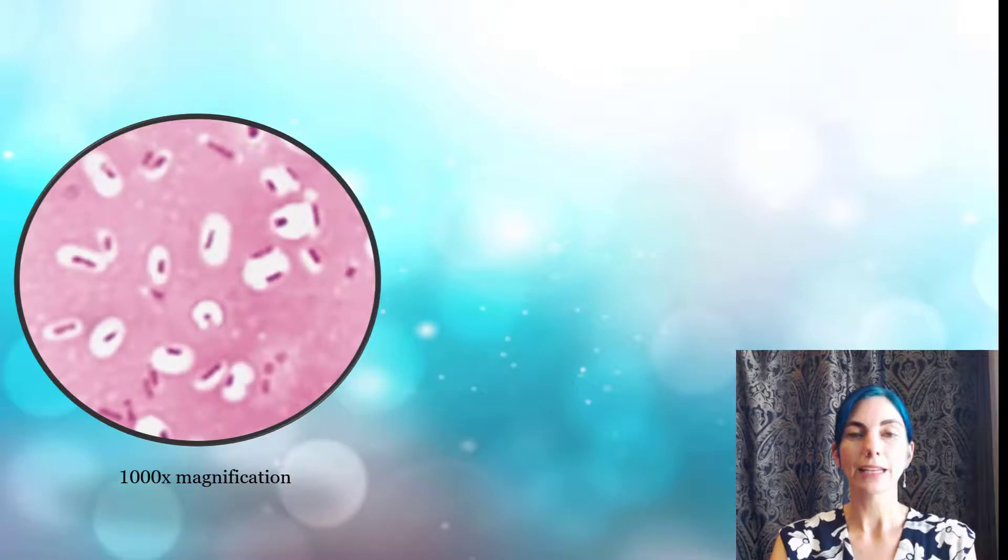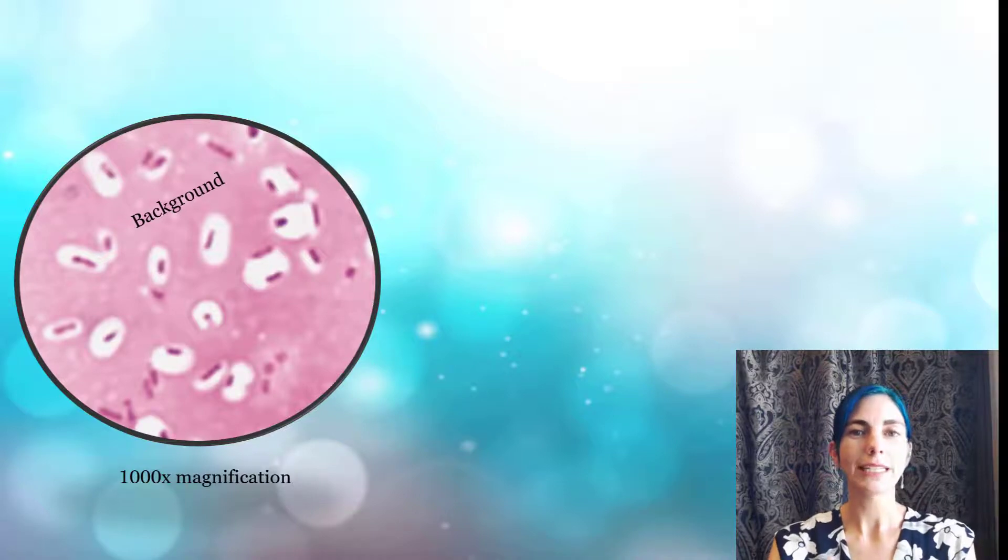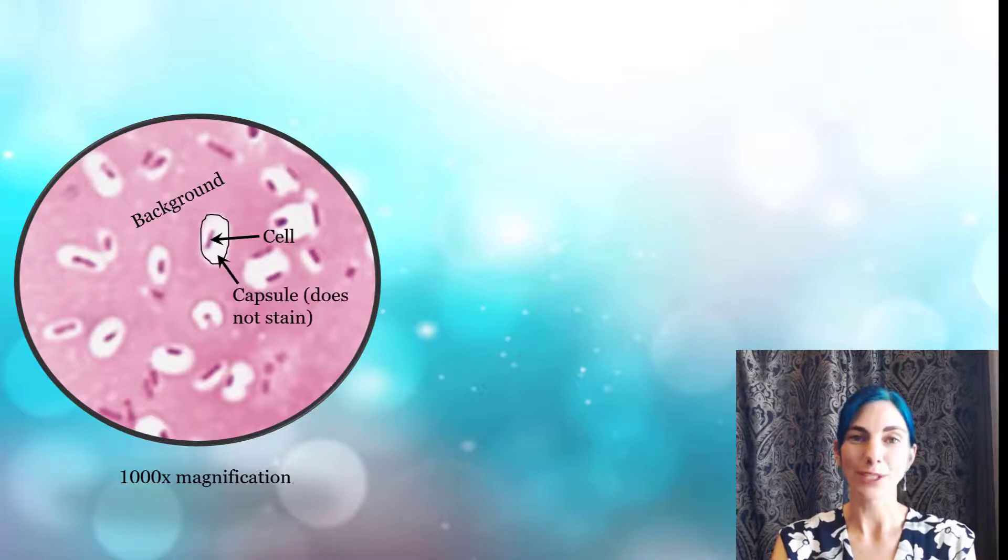Well let's blow up this image just a little bit and see if we can identify some parts. So the first thing to identify is where is the Congo red that stains the background? Well it's here. Notice it's actually not red but more of a light pink color. Now we need to identify the vegetative cells. The vegetative cells are stained with Carbofusion and I have identified one right there. Now the only thing that's left are these white halos. The white halos are the capsules.